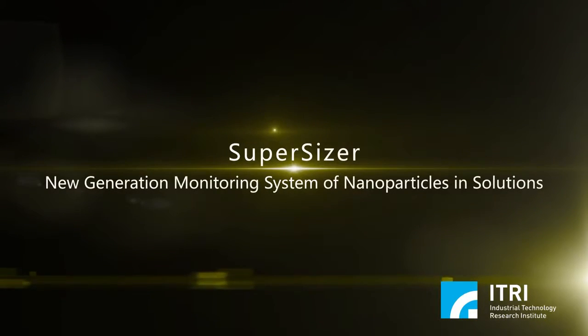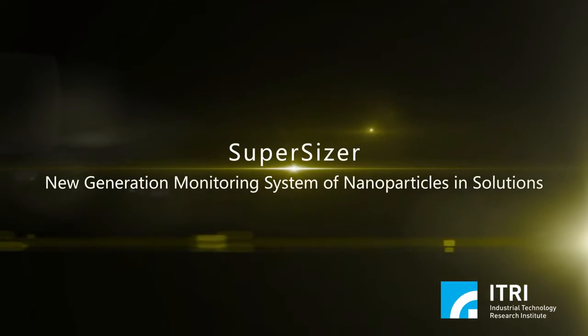SuperSizer, new generation monitoring system of nanoparticles in solutions.